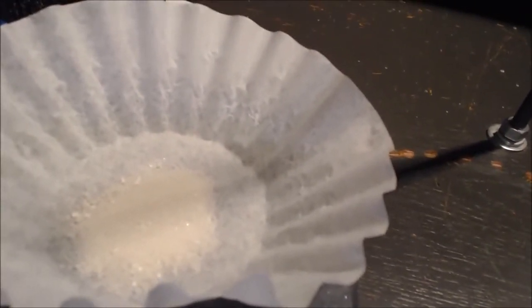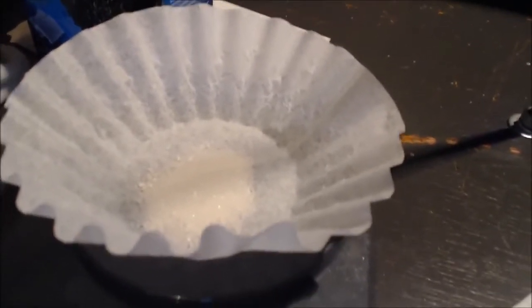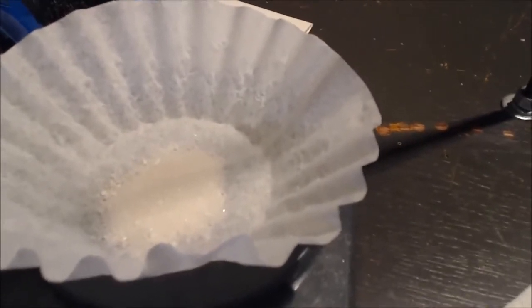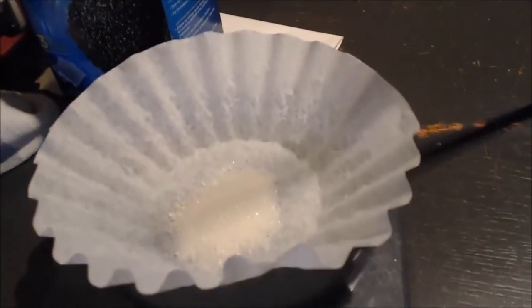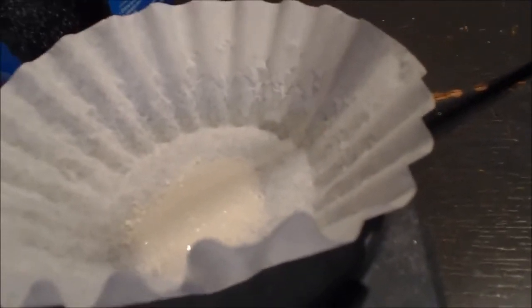But I did like this potassium carbonate in the ethanol thing. I love this idea. I think most of this that I filtered out, some of that I bet is not potassium carbonate, but just potassium acetate that didn't have enough time to go into solution. That's all. I only had a little bit of ethanol. That's why I only did half of the stuff that I had. So if I would have had more ethanol, I think this would have been better.